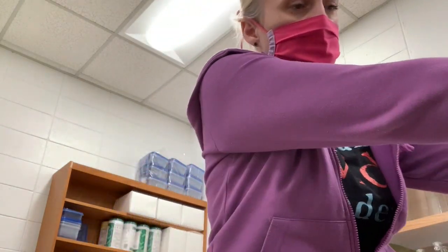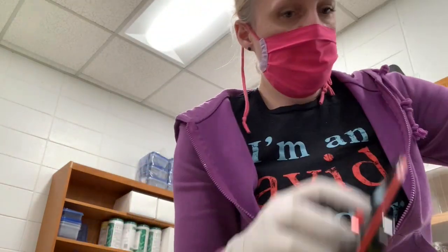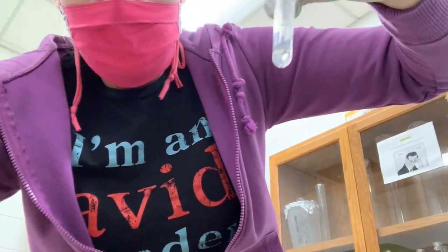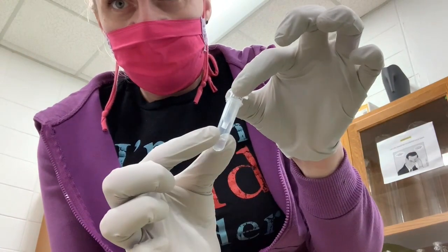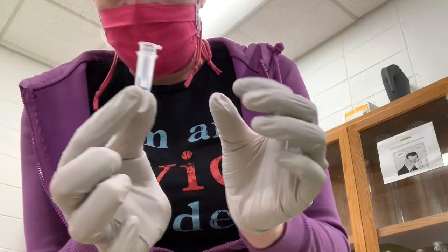So the centrifuge is stopping. I'm going to hit open and take the lid off. And I can show you that now the liquid is in the bottom, not in the column. So what I'm going to do is, for all of these tubes, I'm going to take them over to the sink and dump out the liquid and then put the column back on, okay? I'm going to do this for all of the tubes.